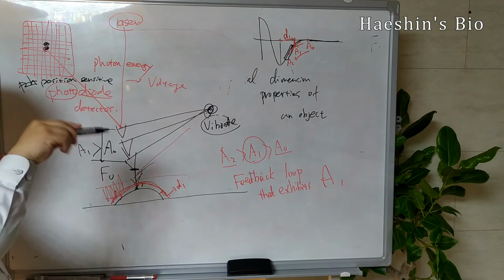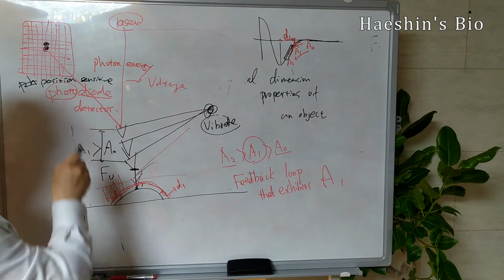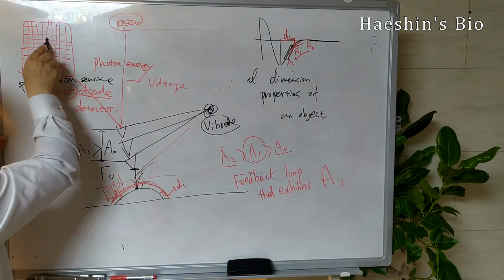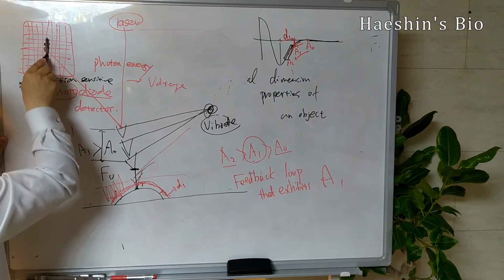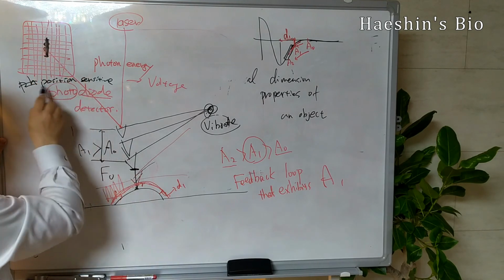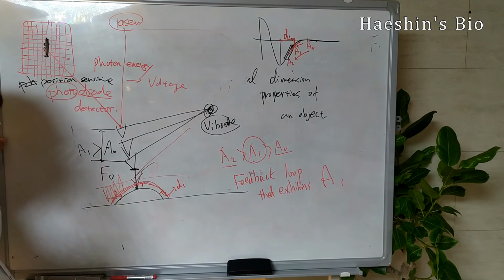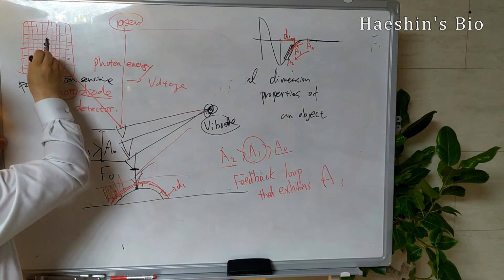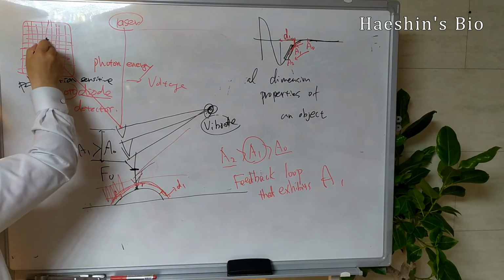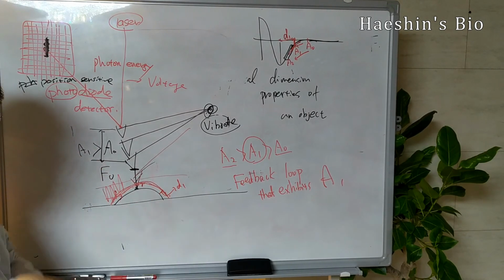So actually it's vibrating, and there's a laser. The laser is reflected here, and then there's a line that comes up. As a result, the vibration causes the laser to move, vibrating like this. The resulting line is detected on this position sensitive photodiode. So each position has a specific photodiode, so you can tell the machine that this one was activated, this one was activated, this one was activated, but not activated here. So they can actually see the size of the amplitude.